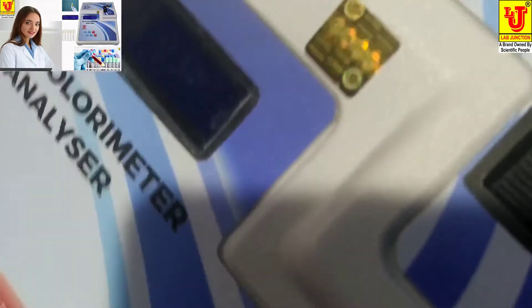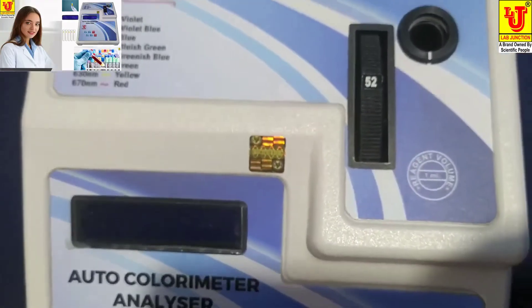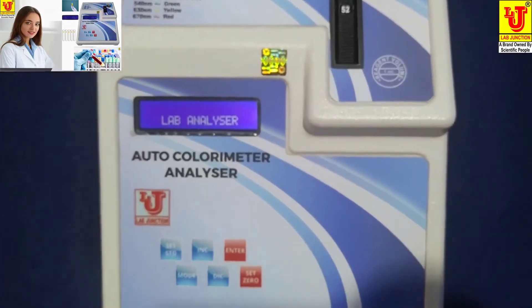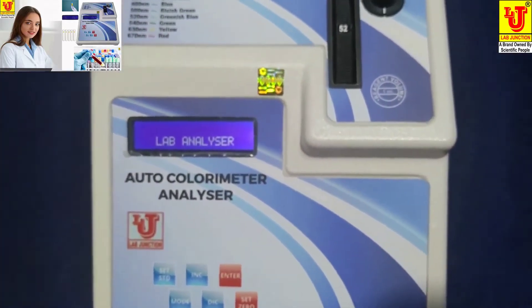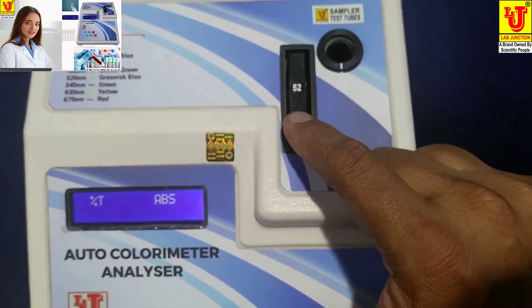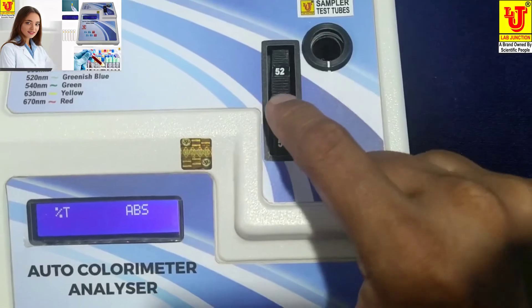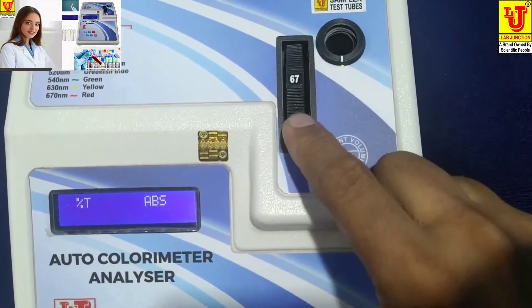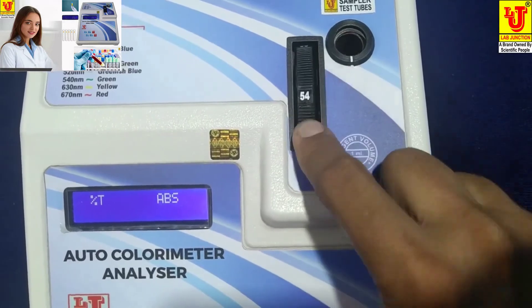Now, how can we test a sample with this colorimeter. I am switching on the instrument and selecting filter 540nm like this. This is 540.